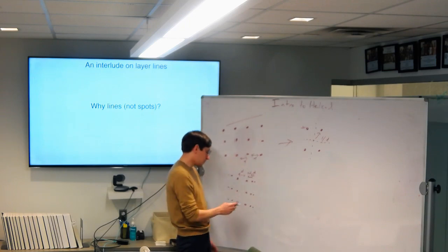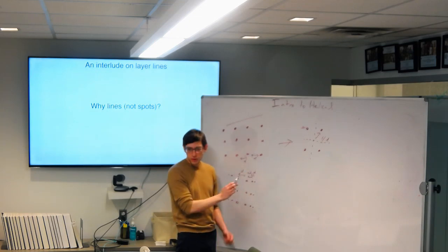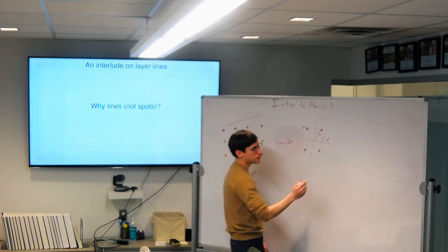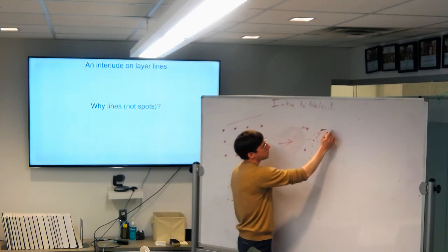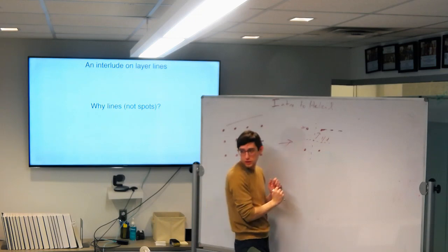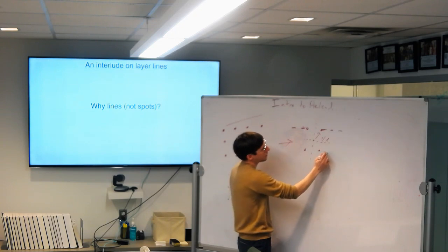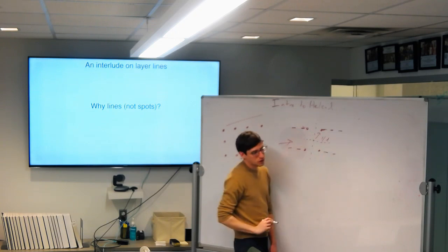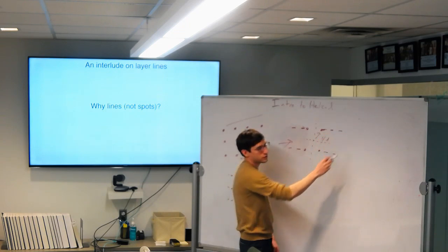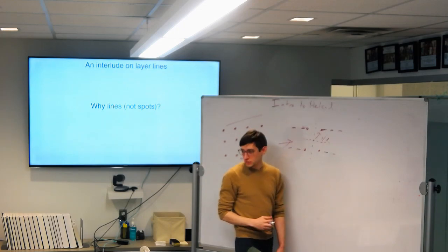And so if something is the inverse, then if it looks closer together in real space, it will actually extend farther in Fourier space, right? So that's why you get the lines. You are stretching out the spacing in Fourier space from these spots that become closer and closer together in real space. And because we have the front and back of the tube, that's how you get these extended lines in Fourier space. So you really want these nice long lines, because that's telling you that your tube is nice and round, and that you're getting nice high resolution images of your tube.